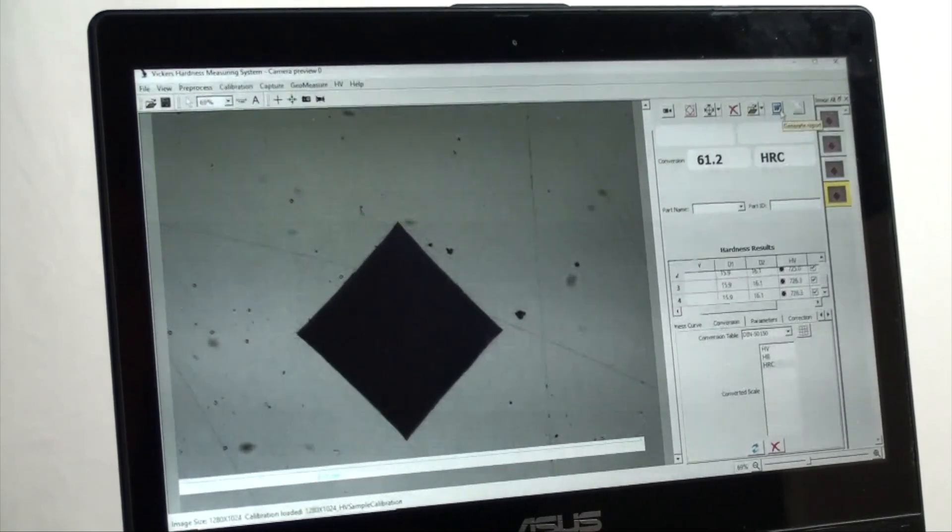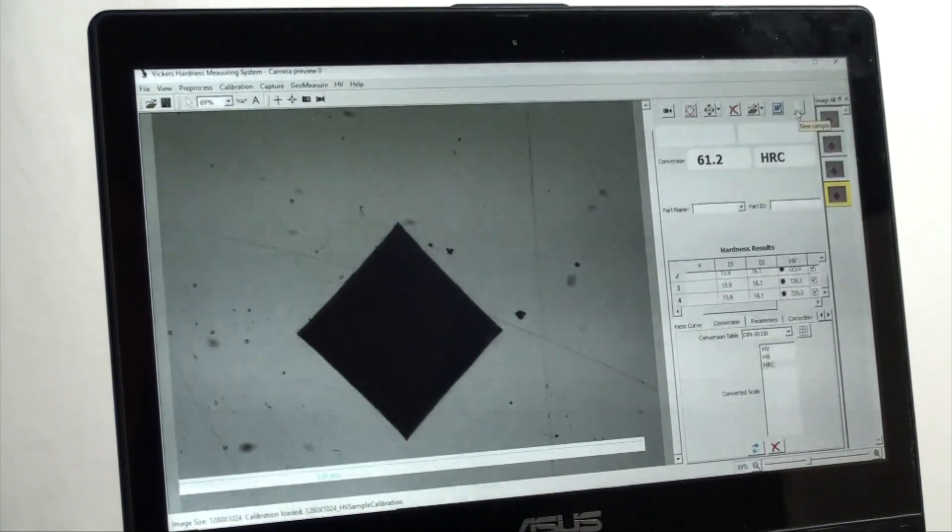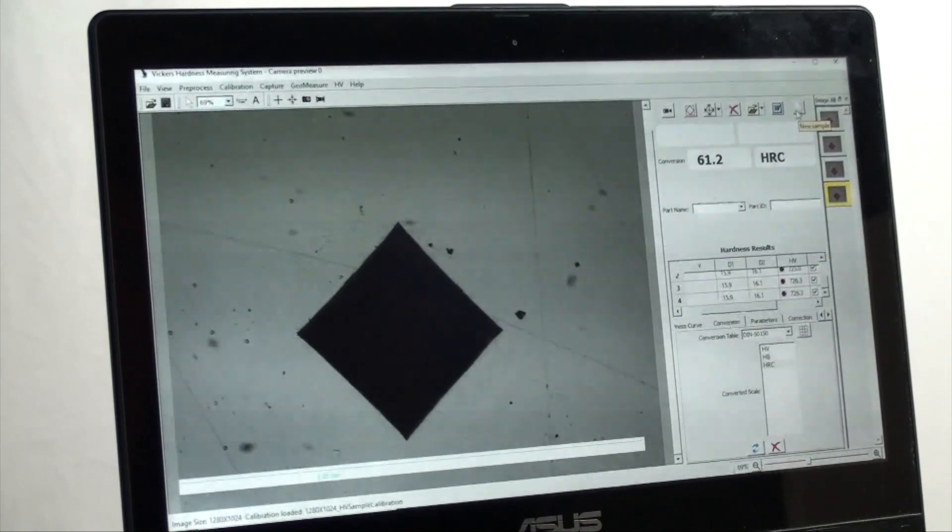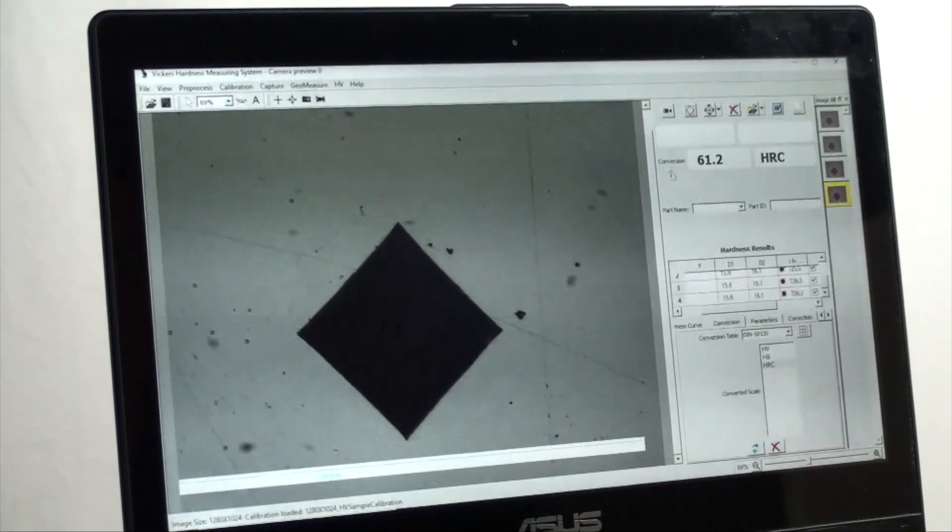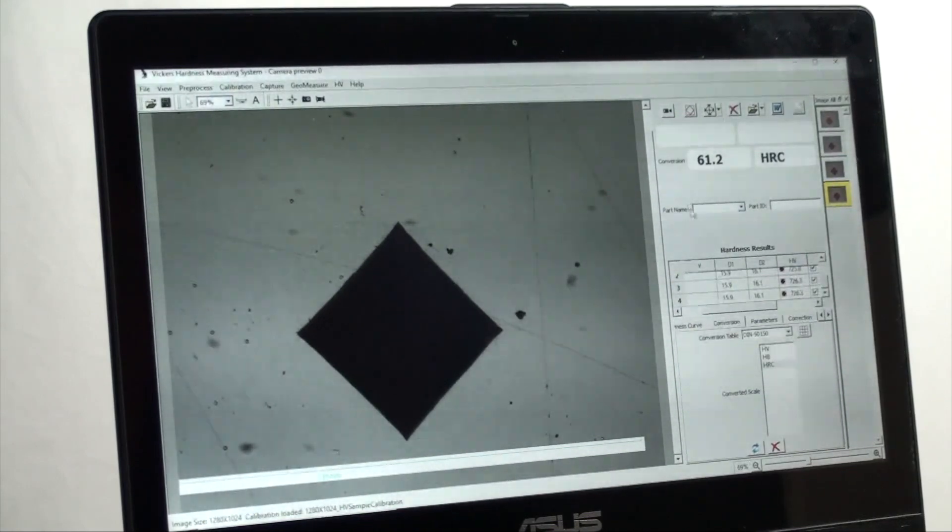On the far right you have an image library. Conversions below that. And farther below we have a table for hardness test results.